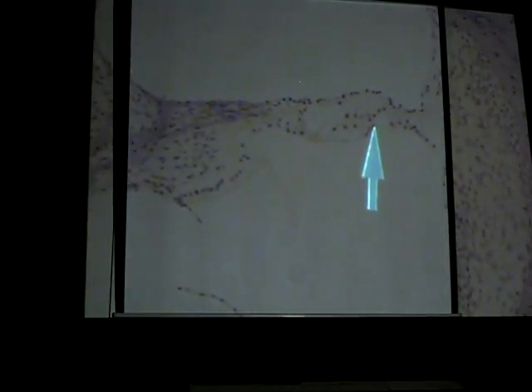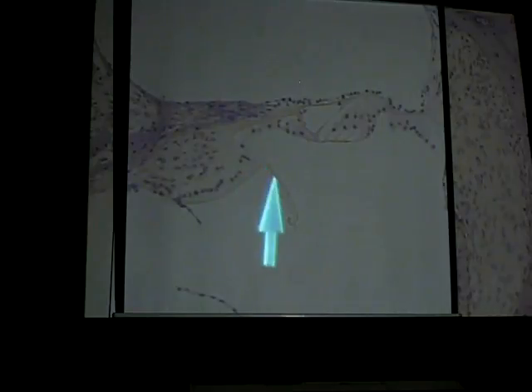All right, so we have our organ of Corti here, and it's usually sitting on what's called the basilar membrane. In this particular section, the basilar membrane is actually towards the top. So this would be your basilar membrane, and this section would be your organ of Corti. Then you have this little membrane sitting on top of the organ of Corti. In this one it's pointing upwards, but it's usually touching the organ of Corti. That's your tectorial membrane.